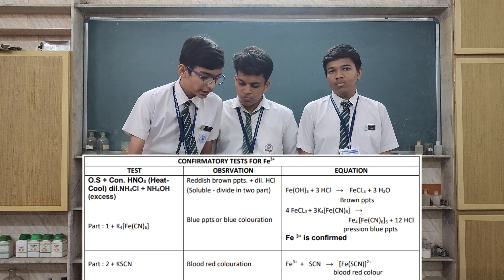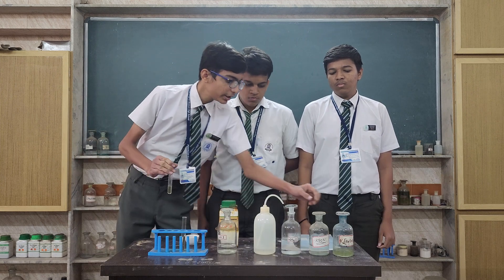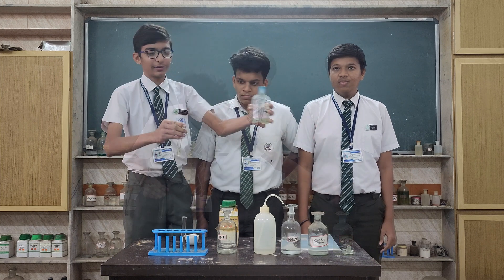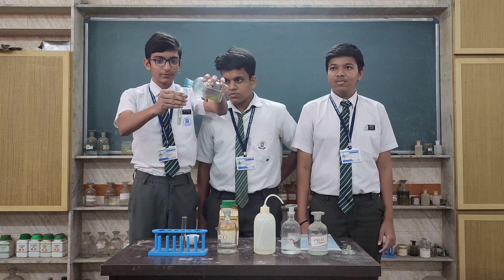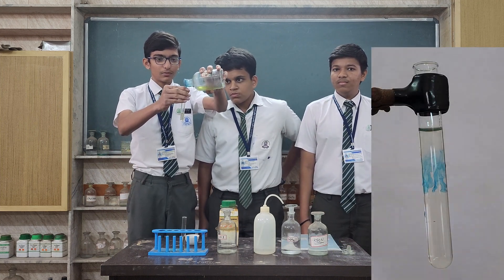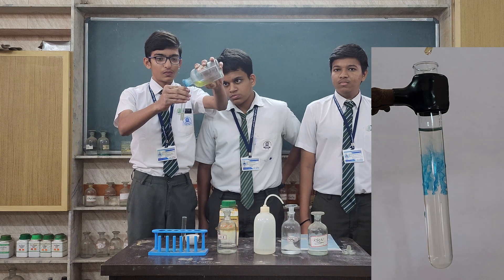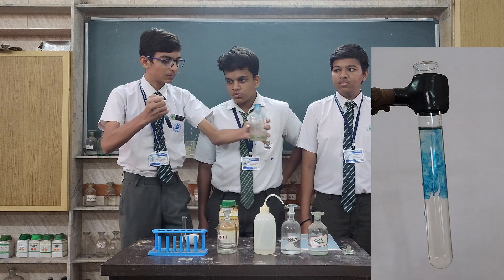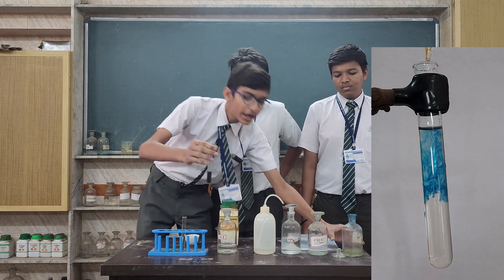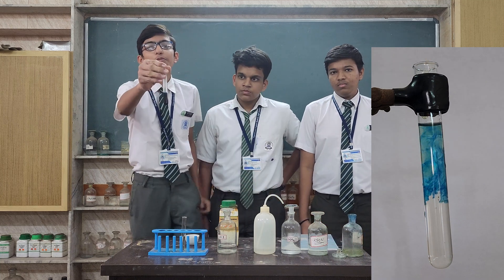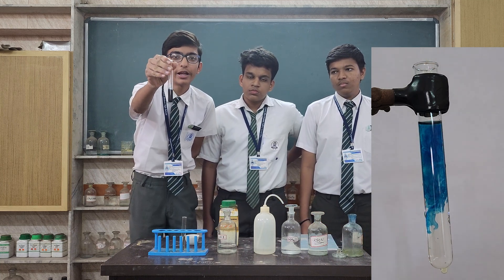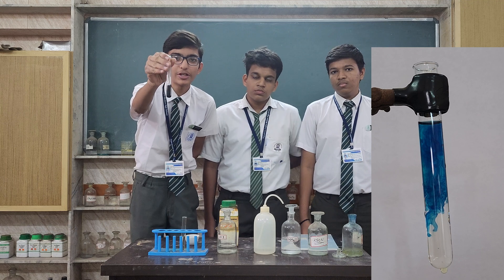Now take Part 1 and add K₄[Fe(CN)₆]. As you can see, Prussian blue is obtained. This confirms that Fe³⁺ is present.